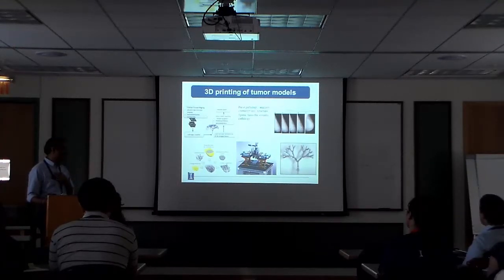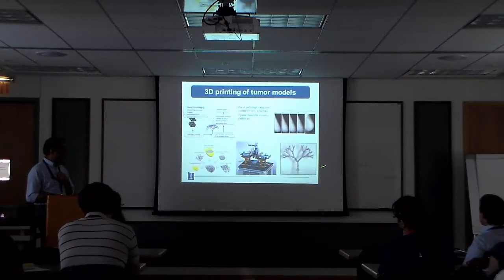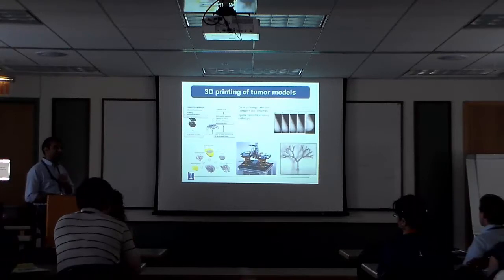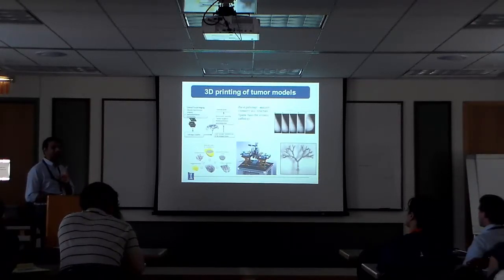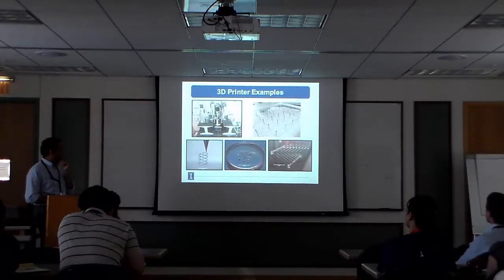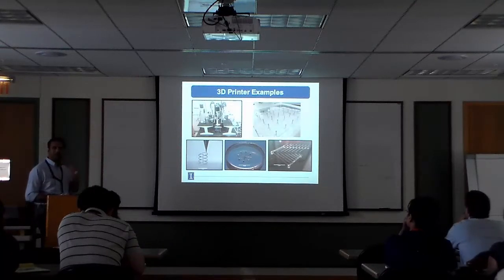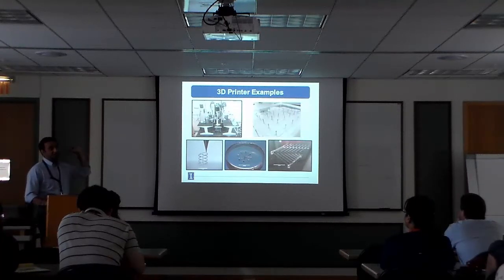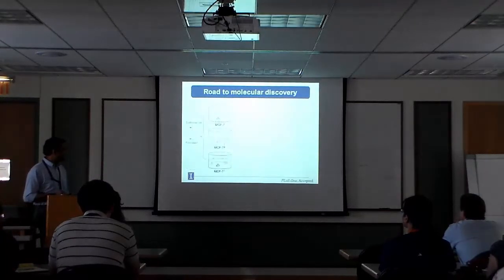The next thing, which is quite interesting if you spoke to the student downstairs, is it takes us exactly as much time to print this with a 50 micron feature size as it takes to print this on a commercial printer at 1 millimeter size. Okay, so we're very, very fast downstairs, and we can do this quite rapidly. We can do other things, but I just want to point out what we've done here. We can print trees, so I can make you 24 identical-looking breast scaffolds. We can grow breast cancer cells on these, and you'll have 24 identical breast cancer samples to do drug discovery or what have you, or imaging if you're interested.